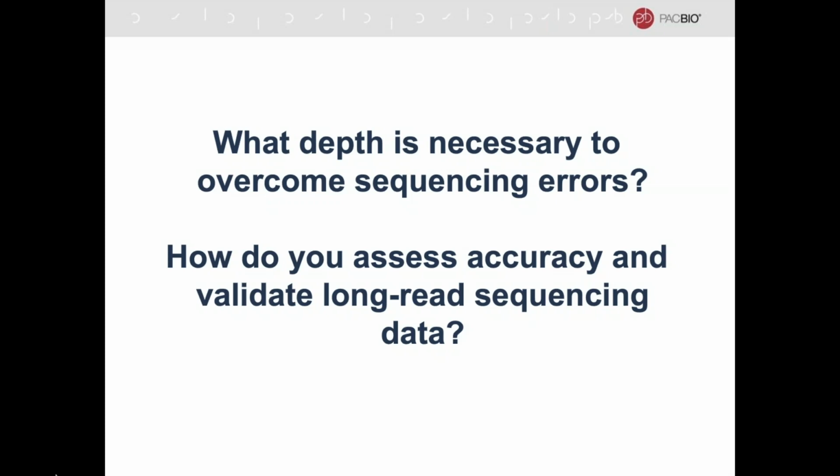And yeah, I agree. I think we can get decent assemblies with even down to 20x coverage in the corrected reads based on the subreads. So the HiFi reads already have low error rates, though again, I think this still needs to be determined.